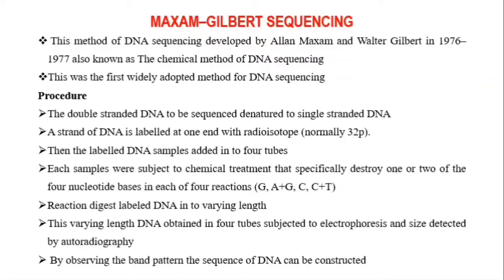One end of that single stranded DNA should be labeled with a radioisotope.